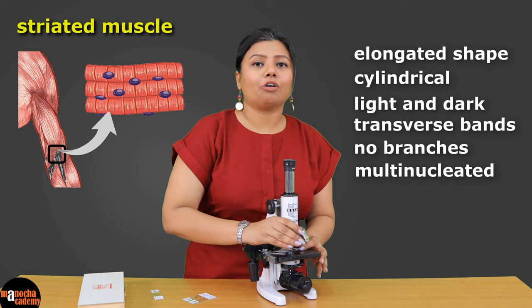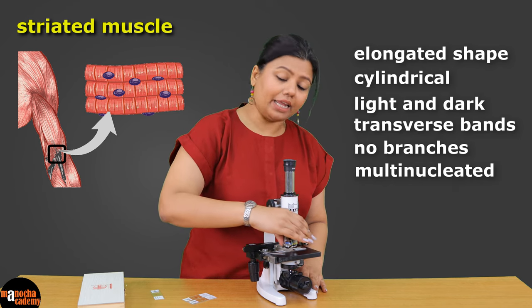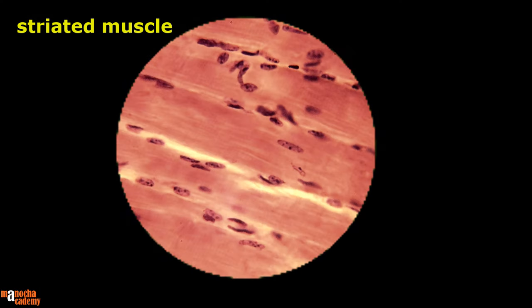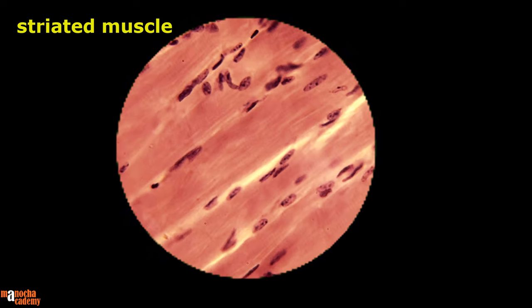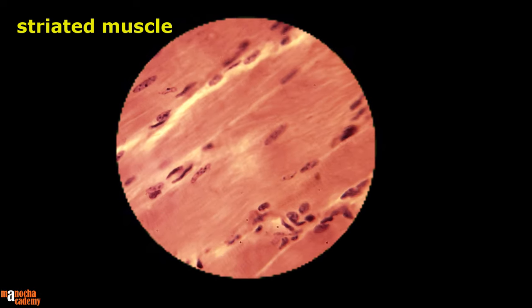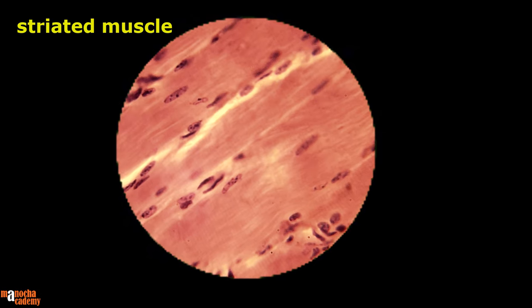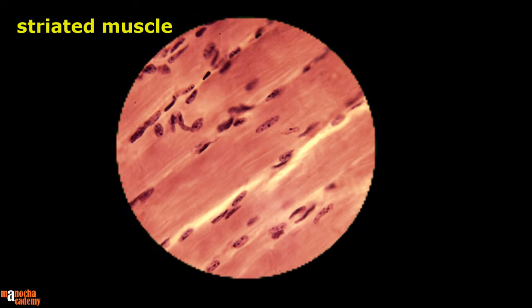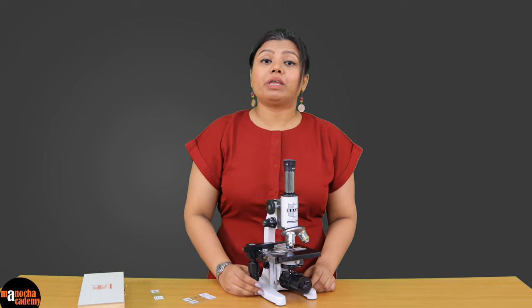Let us see how they look at 100x magnification. This is how it looks at 100x. Now moving to 450x magnification — you can clearly see the cells. The cells are not branched, unlike the cardiac muscles. So those were the three muscle cells.